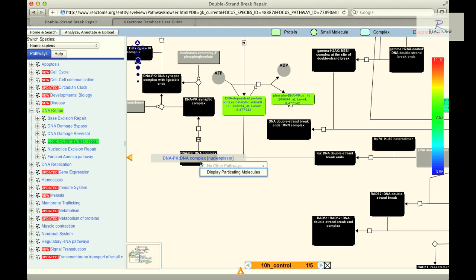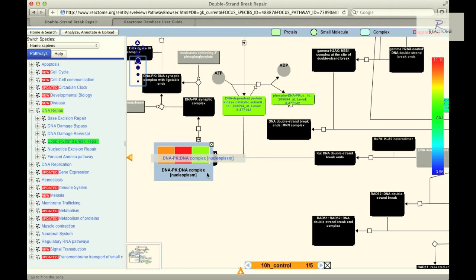Right click on the same complex entity and select Display participating molecules. A pop-up box should appear with a grid of colored squares inside it, representing expression levels for the complex components.